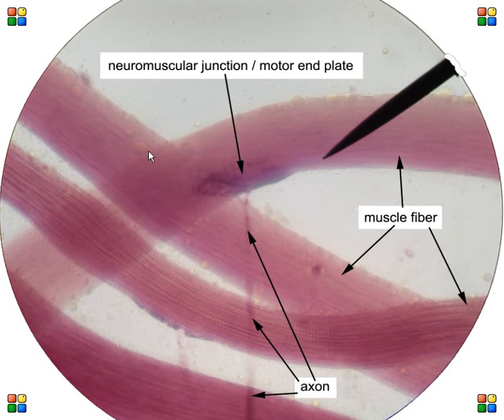So I tell my students they can call this the neuromuscular junction or the motor end plate, either one if I put the pointer on it. And obviously this is the axon and all of these tubes are muscle fibers.